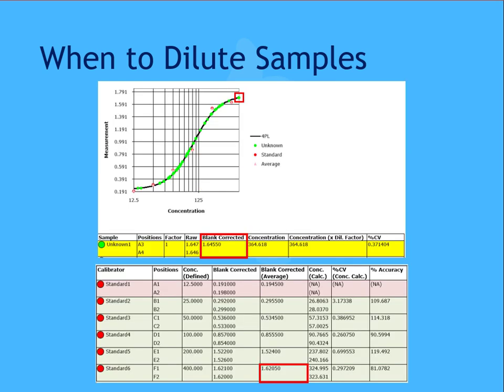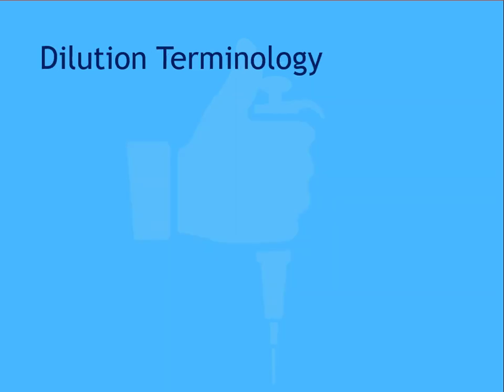Looking at this example a little closer, you can see on the curve chart that unknown one is at the very top of the chart, with no additional standard following this unknown sample. The blank corrected value, 1.64550, is greater than the highest standard value of 1.6205. So although the concentration result is calculable, it is always preferable to report interpolated results, or results that fall within the range of the standards. So once we've identified cases where samples should be diluted, next let's discuss dilution terminology.